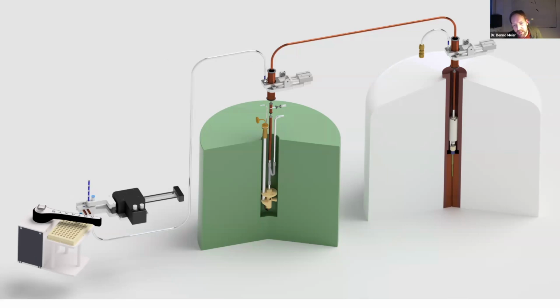You can see it arriving here. The switch would be shifted to the right, and then the bullet would go all the way into this space here. This is an airlock, so we can close now these valves, and then we can replace any nitrogen or air in here with helium. And once we are sure that there's no air and no nitrogen, then we drop it into the polarizer and polarize it.